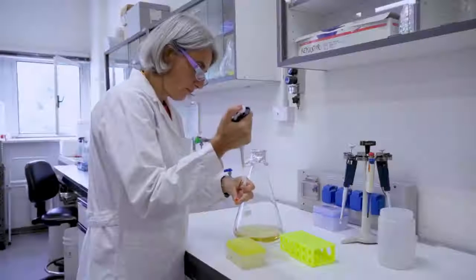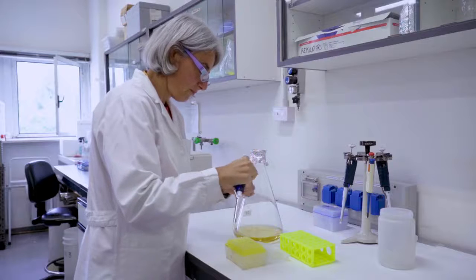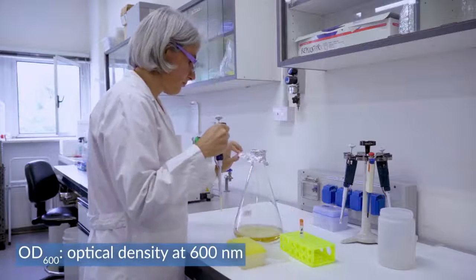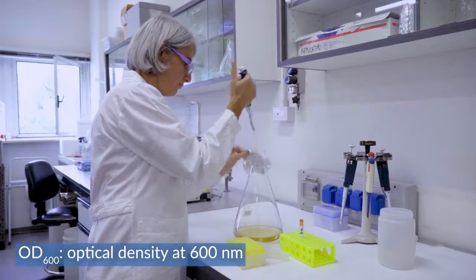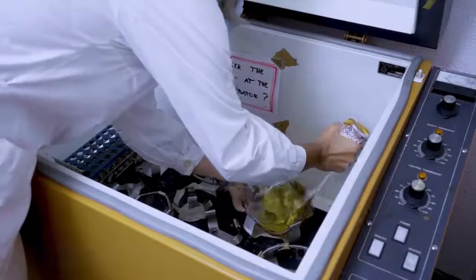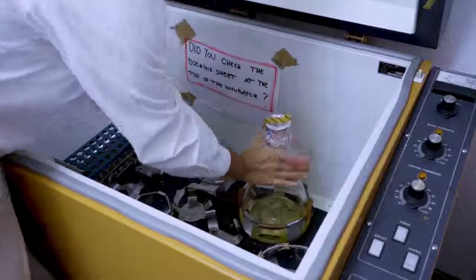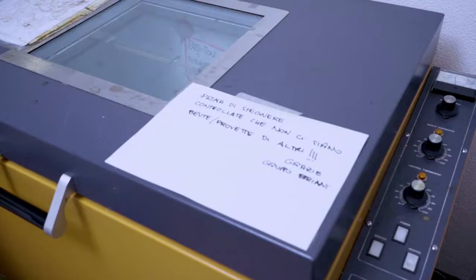To prepare a phage stock for the experiment, add 1.25 times 10 to the 7th phages to an OD600 of 0.05 P. aeruginosa culture to a multiplicity of infection of 1 times 10 to the negative 3, and incubate the culture for 3 to 4 hours with shaking until the OD600 drops to 0.1 to 0.3.